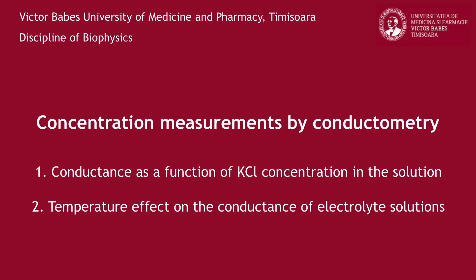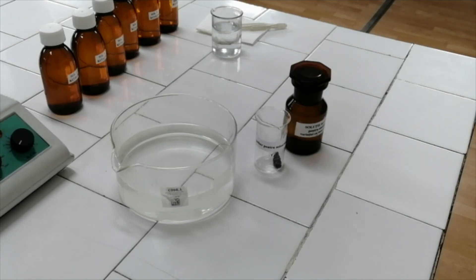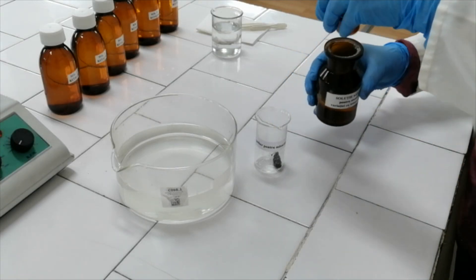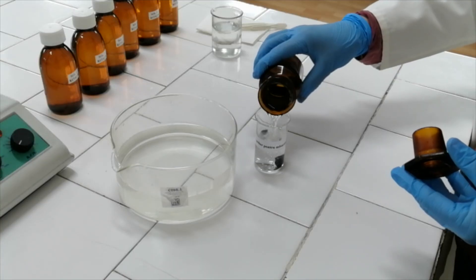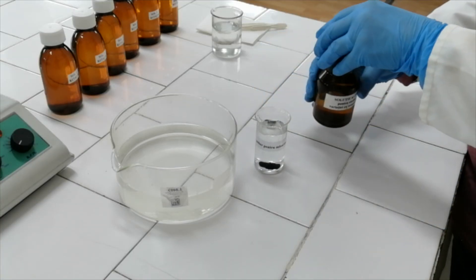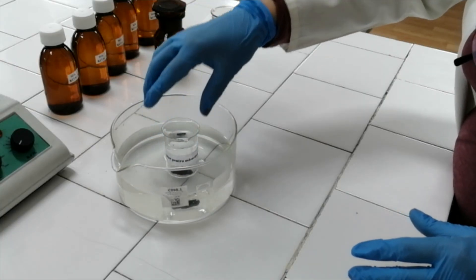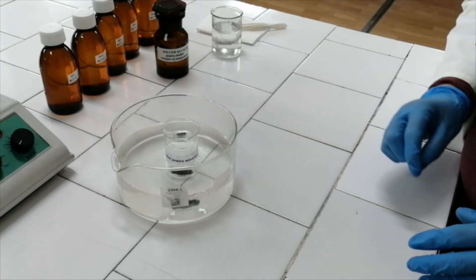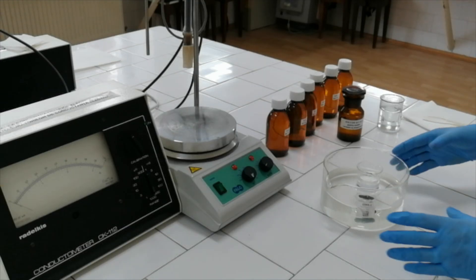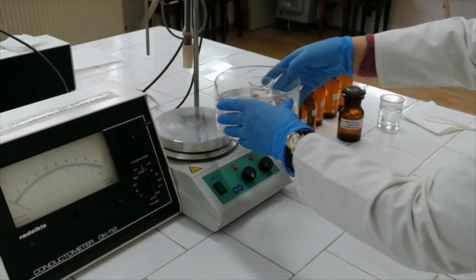In the second part of this experiment, you will study the temperature effect on the electrical conductance of electrolyte solutions. For this, you will use a potassium chloride solution of known concentration. Pour this solution in the measuring Berzelius glass and place it in the crystallizer. Add tap water in the crystallizer to avoid the fast and uneven heating of the study solution. Place the crystallizer on the magnetic steerer hotplate.